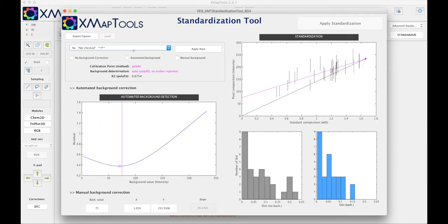Now let's select sodium. For sodium it's easier because we see that we correctly interpolate the trend observed in the composition and we get a background value of 75.